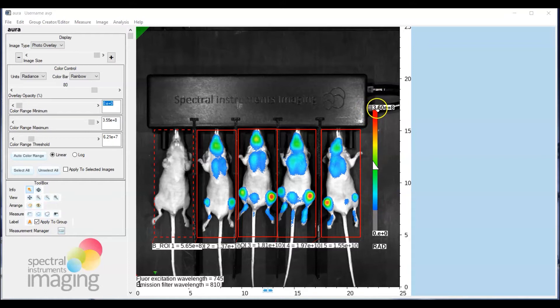the calibration bar captures the max and will go to zero as a default minimum, when in fact the threshold data that's presented in your image is above zero.